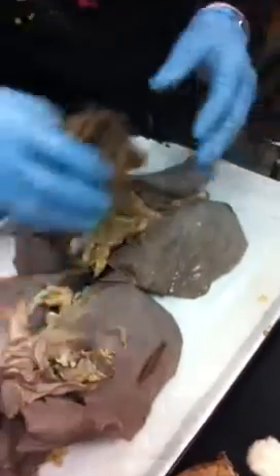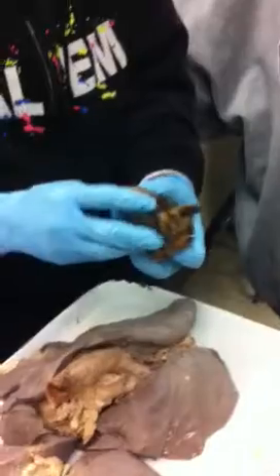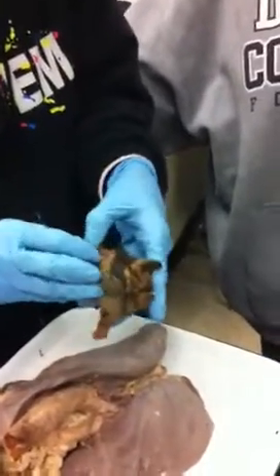Is this a larynx? Oh, okay. Alright, this is actually the larynx of a sheep.